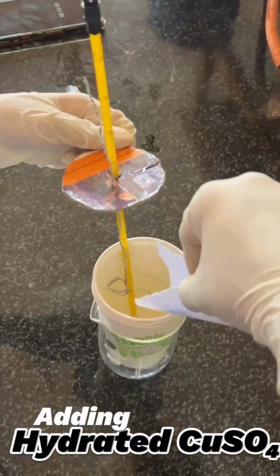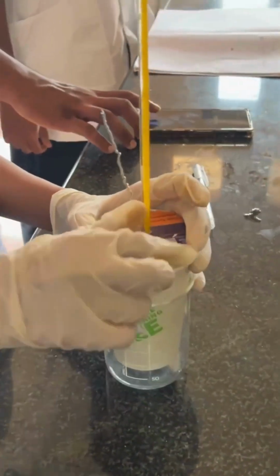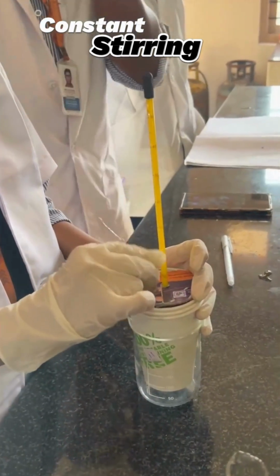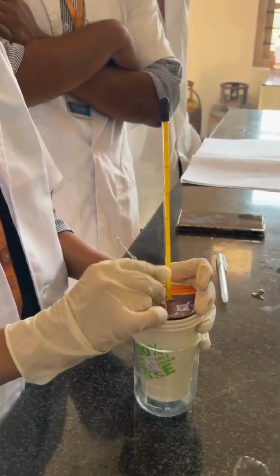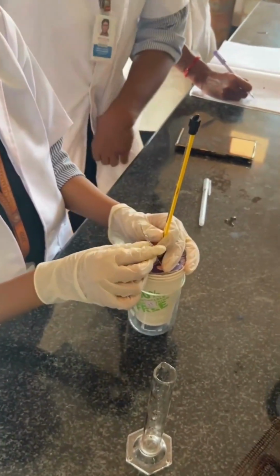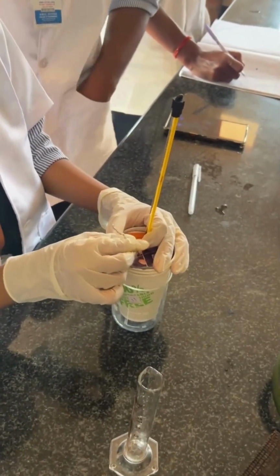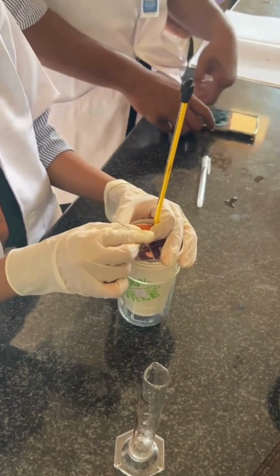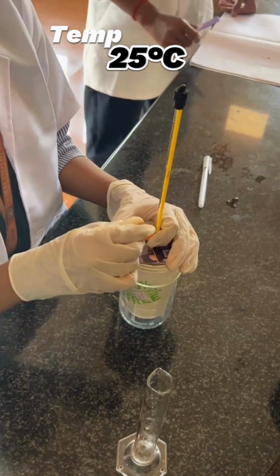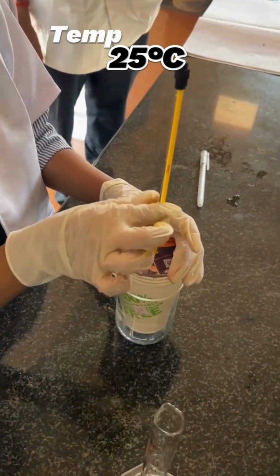After adding the salt and stirring, the temperature decreases to 25 degrees Celsius. This temperature drop confirms an endothermic reaction where heat is absorbed by the dissolving process.